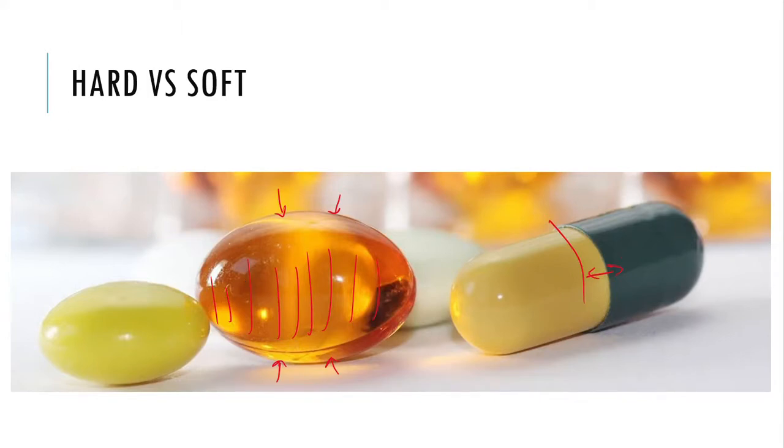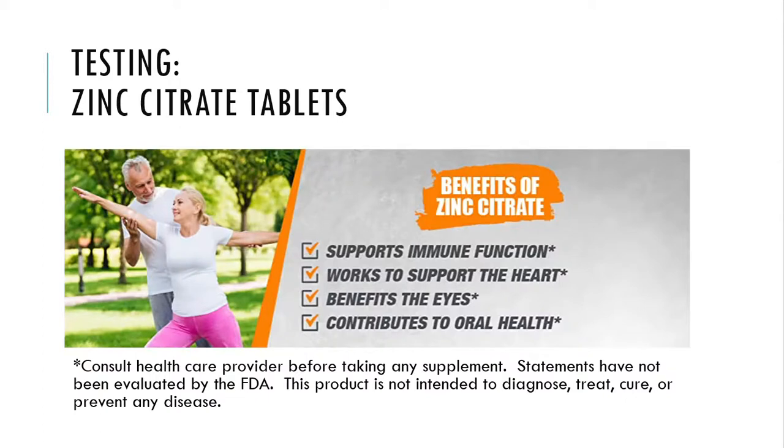All right, so in today's lab, we're actually going to be testing zinc citrate tablets. And we picked zinc citrate for a number of reasons, and we'll talk about those in just a minute.